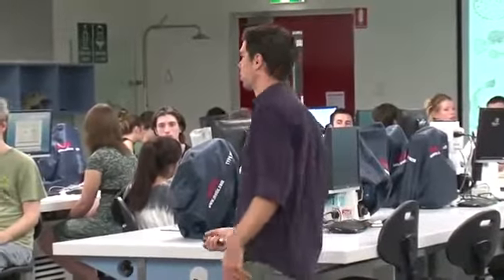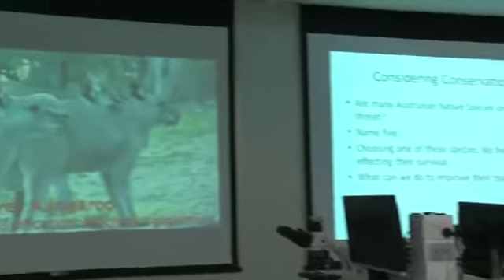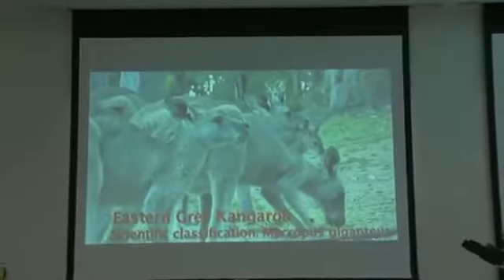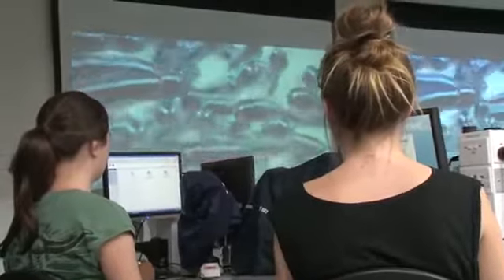Each of the 4 labs has projection screens, one of which is a digital whiteboard that can run multiple screens of information simultaneously. Full internet connection is available, allowing the utilisation of movies and teaching aids from all over the internet, including Macquarie University's own YouTube channel.